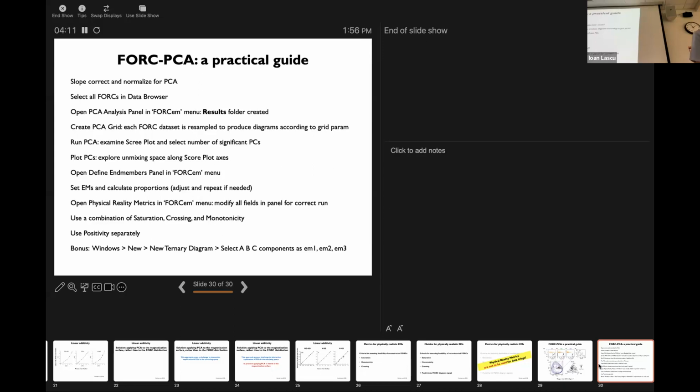Yeah. So I've never used PCA before, so forgive me. But just so that I understand it correctly, when all is said and done, you calculate the end members, and using the IRM unmixing analogy, would it be proper to say that each of those end members in a perfect world represents, like, 3 different phases of which all these samples are composed in different proportions?